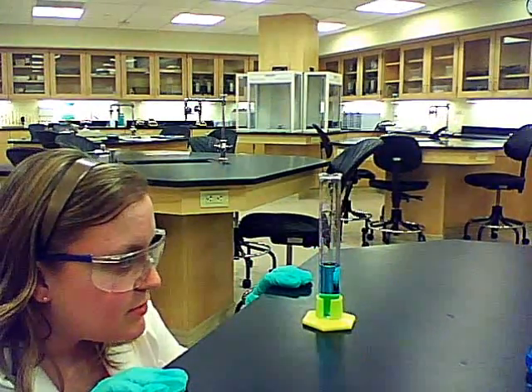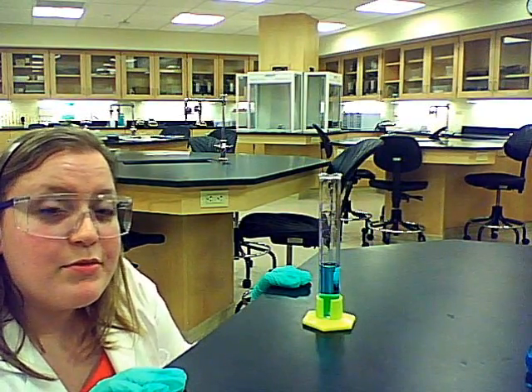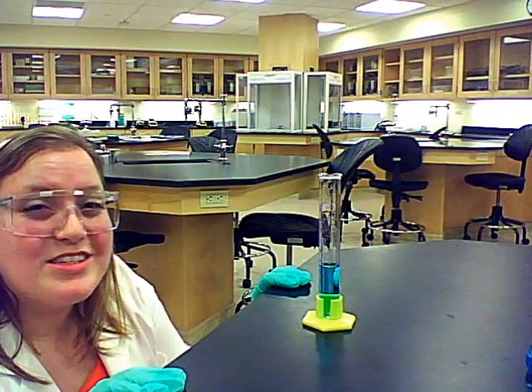This line happens to be 1, 2, 3 tick marks above 20 milliliters, which makes it 23. Now, that is reading from the bottom of the meniscus. If you read from the top of the meniscus, you actually get a volume of 24 milliliters, which is incorrect. Reading the incorrect volume from your graduated cylinder will give you incorrect calculations and alter your laboratory notes.